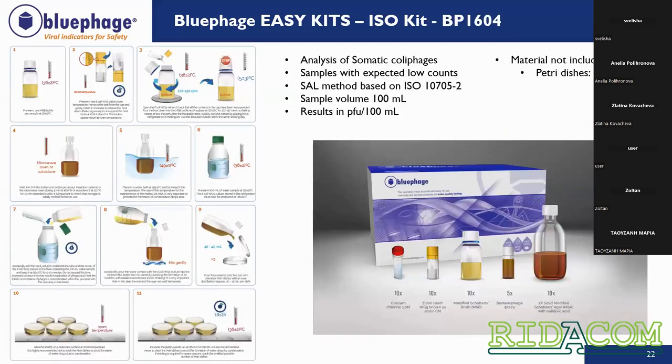In that case, as we said before, it's crucial to temper, to pre-warm the water sample. The kit, as you can see in the picture on the right, has fewer materials and reagents. It's easier than the previous one. The only material not included in the kit are the petri dishes, because we are analyzing a large volume sample, so it is highly recommended to use 140 millimeter plates.